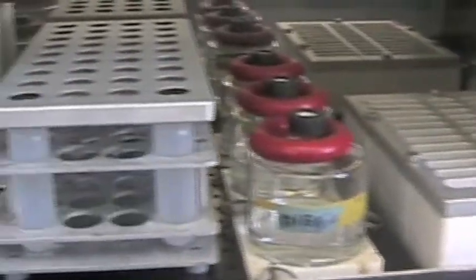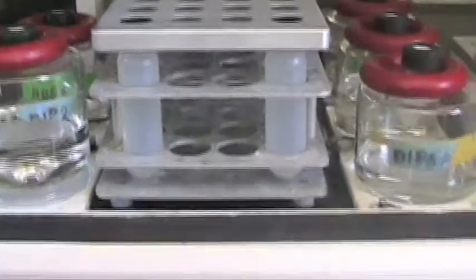So to my right hand side is the well where the mixing of the amino acids is done to make the peptides. The chemicals are the ones you are seeing with the red rings around it, and in the middle there are the amino acid vials.